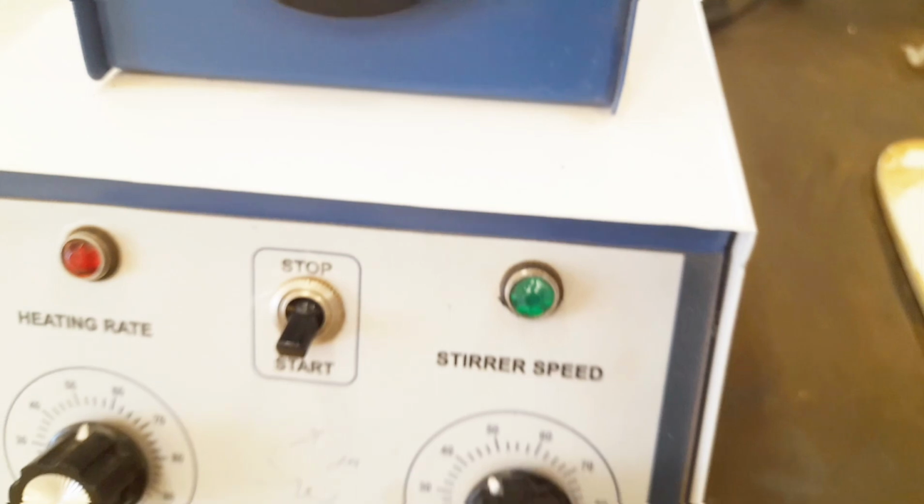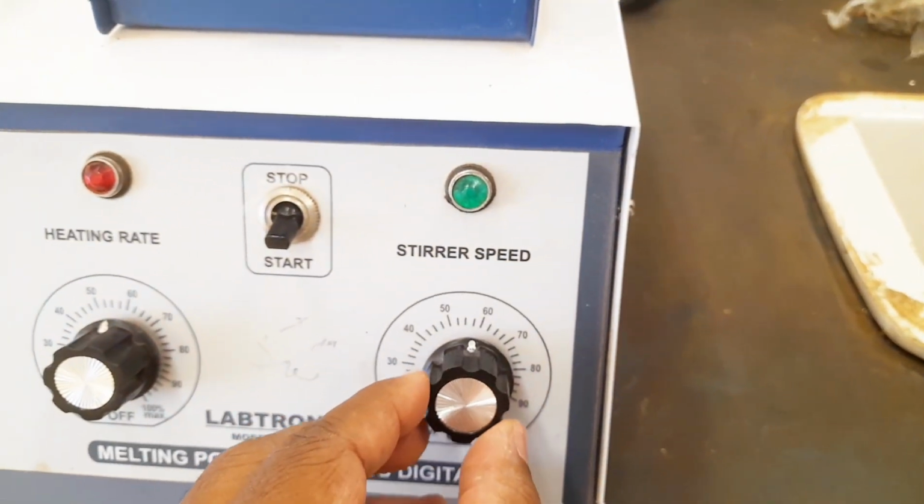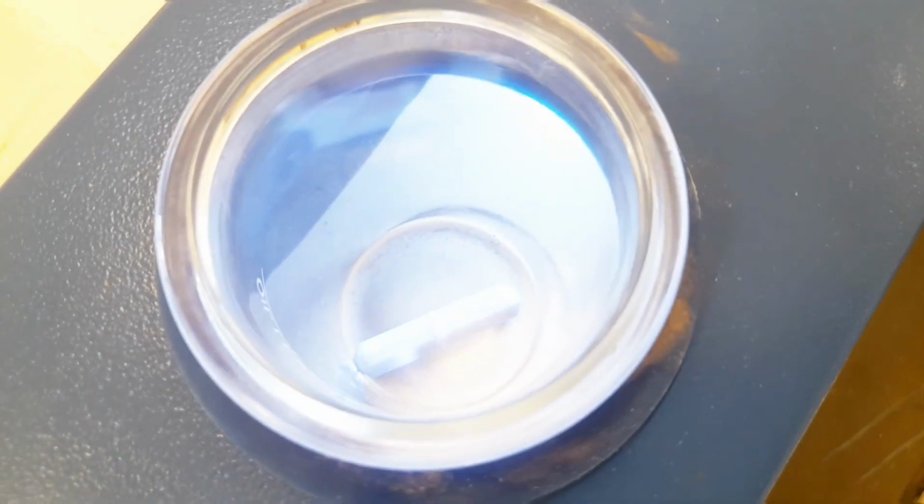When we increase the stirrer knob speed, the stirrer inside rotates. You can see how the stirrer is rotating. The stirrer rotates inside the oil so that there will be equal distribution of heat to all the samples.